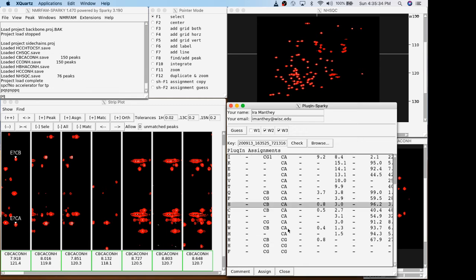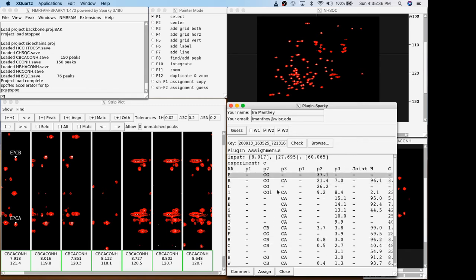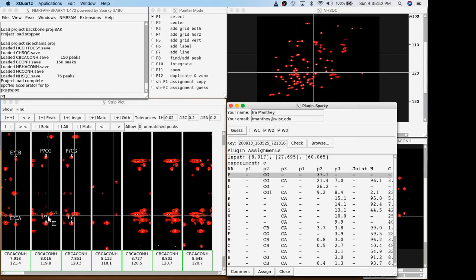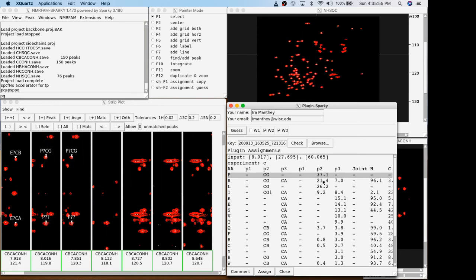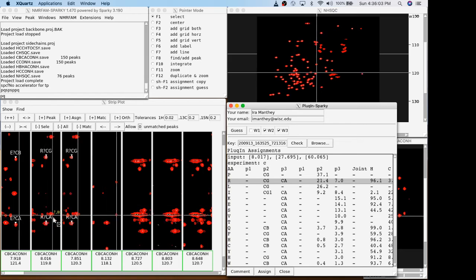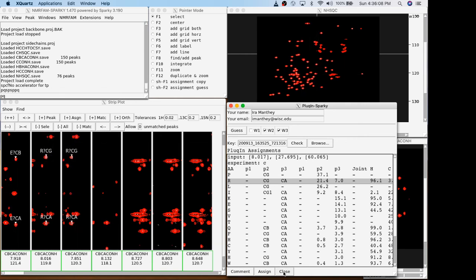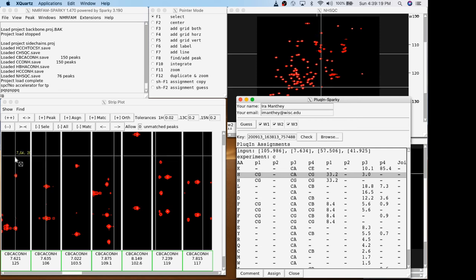And here you can see we have a little bit longer of a list than last time, and we can go ahead and select any of these and assign here at the bottom, and it's going to come up with these suggestions. So when you have only a single residue here, it is not going to know what to do with this second residue. It will simply label it as a question mark. But if you do have two assignments in here, of course, if you click the assign button, it will assume which signal corresponds to which atom.